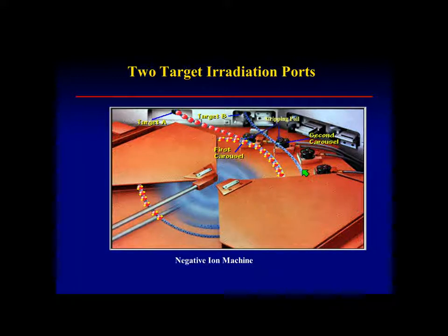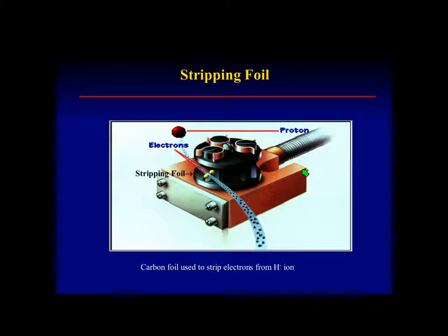Similarly, for fluorine and for carbon, when we want our maximum yields, we bombard 2 targets at the same time, which is very possible. And again, electrons are being passed through, stripping, and ending up with your proton.